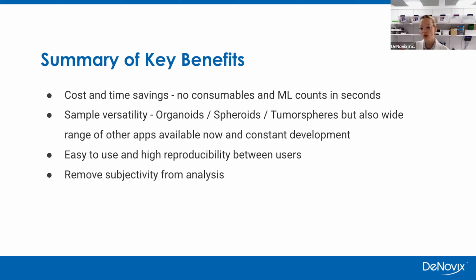The software is easy to use and allows for high reproducibility between users. This will also help remove subjectivity from analysis. So this app can serve as a method to help standardize your data collection and analysis for this difficult sample type. So add some consistency and reliability to the workflow.